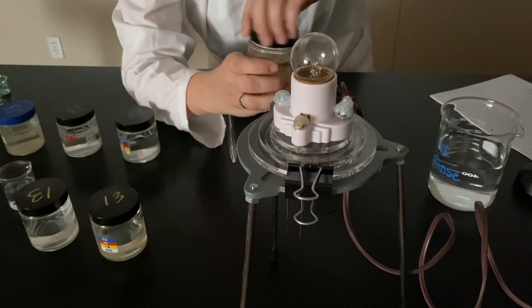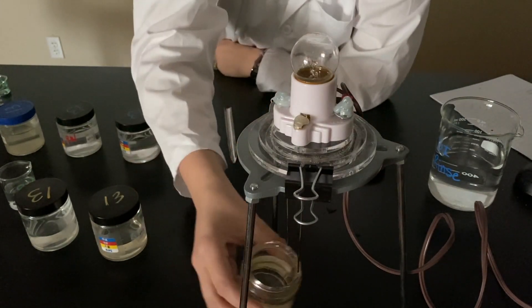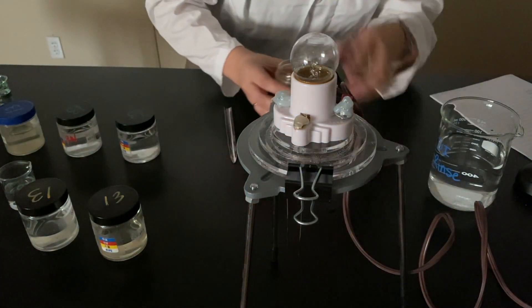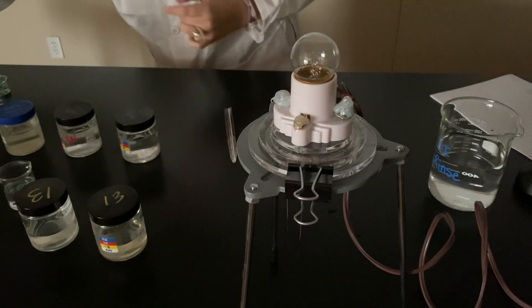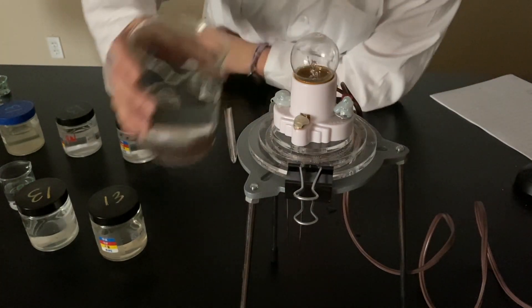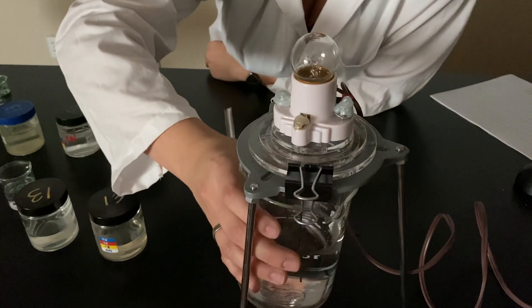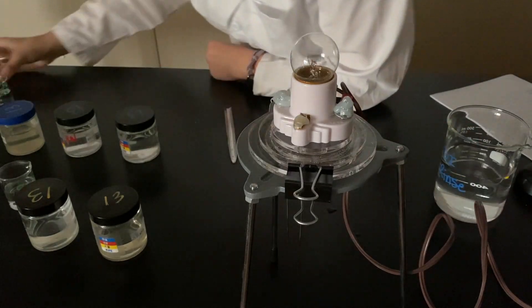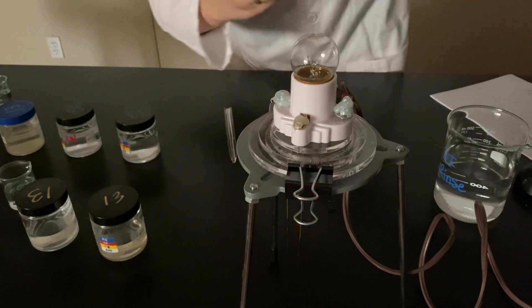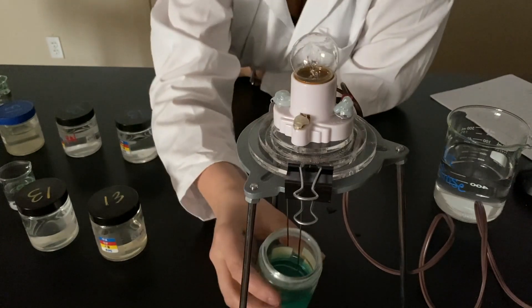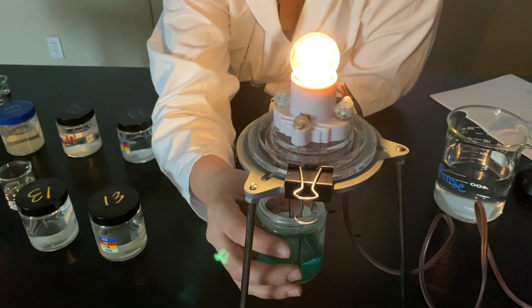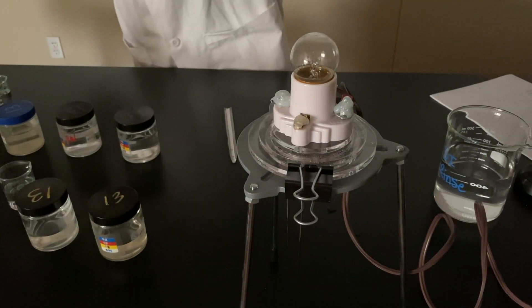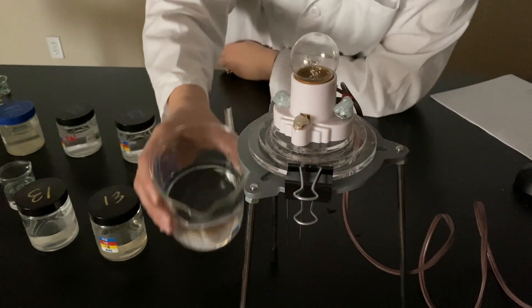And 0.1 molar aluminum nitrate. This is getting repetitive for you. Hopefully not. 0.1 molar copper to sulfate. Beautiful. So lovely. And rinse. Let's do it.